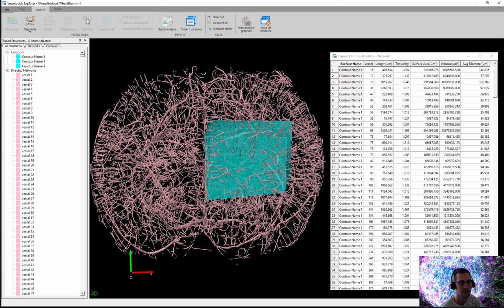But just a brief glimpse of what the puncta tool could detect. If you have proteins, if you have mitochondria, if you have blockages within the vascular network itself, as long as it's labeled, our puncta detection should do a very nice job of getting those reconstructed. And then we can report on that in relation to distances with your vessels, in relation to different puncta themselves, and we can do a nice cohesive kind of colocalization reporting as well. So those are some things to be aware of and to be excited about as well.